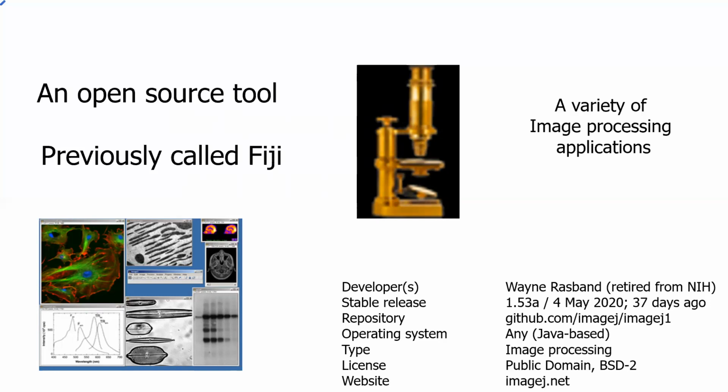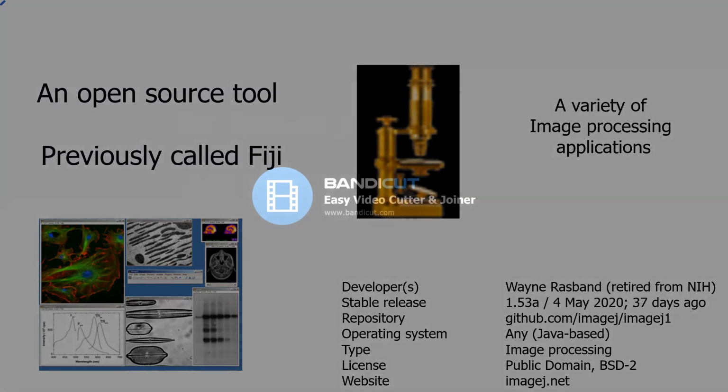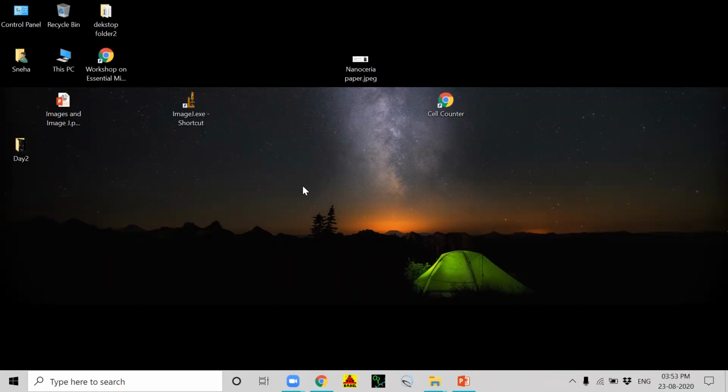So now let's start our practical session. You'll have a day 2 folder where we'll have sample plots, images and software. So let's begin. So now let's switch to the practical session.